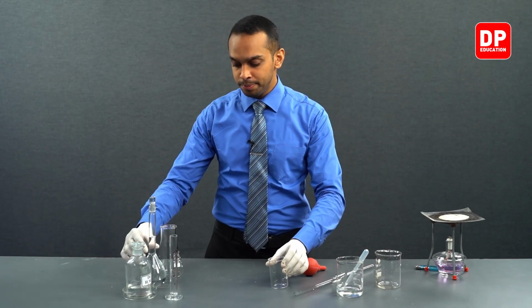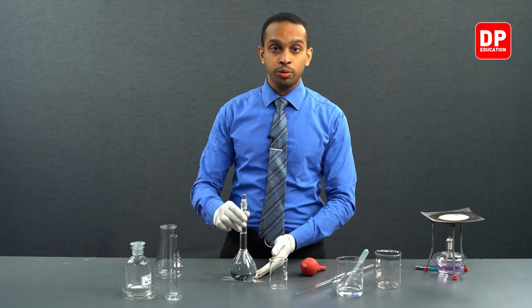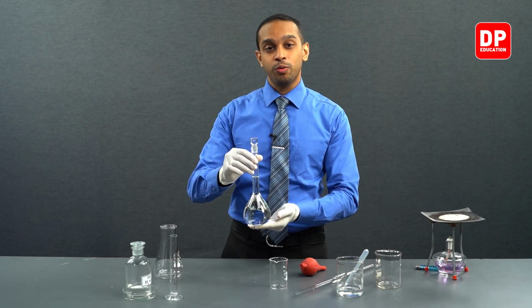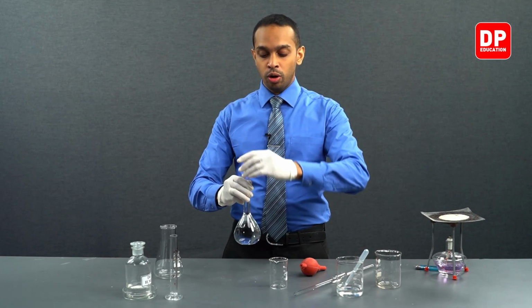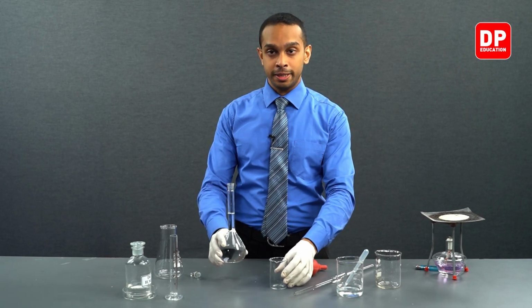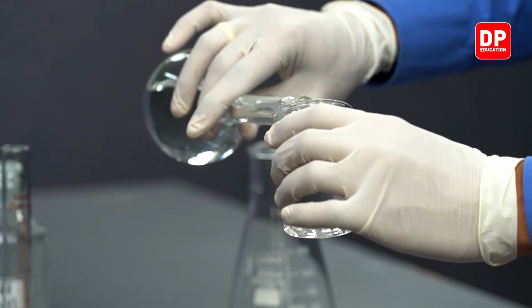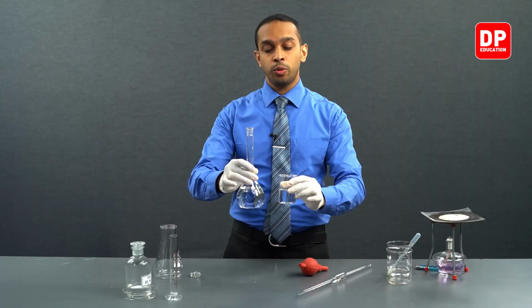Let's take a small beaker and take our volumetric flask. Now this is the potassium oxalate solution that we prepared earlier. We have to make sure that you do not put the pipette into the volumetric flask. That is not a good practice. So we will withdraw a small amount of potassium oxalate into a different beaker. Now let's transfer an adequate amount of potassium oxalate onto a small beaker.